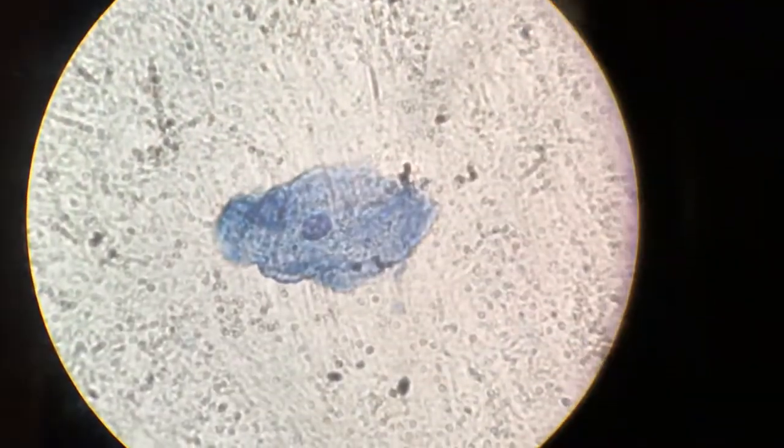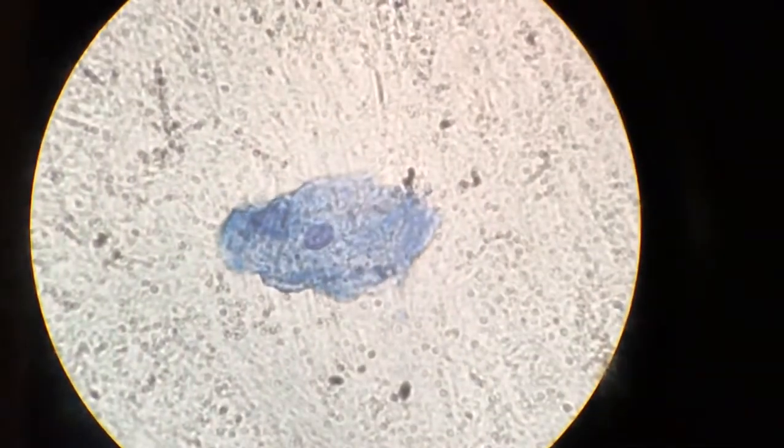You can see it's a much smaller cell than the plant cell. You can see a little bit more detail in this view.